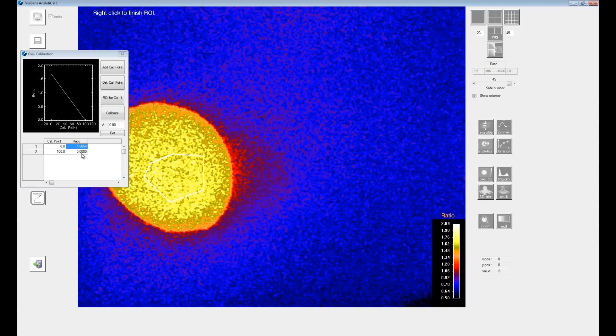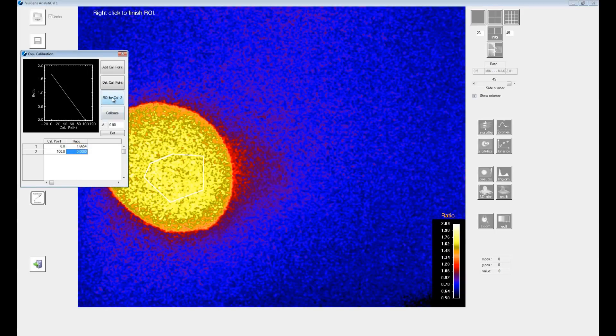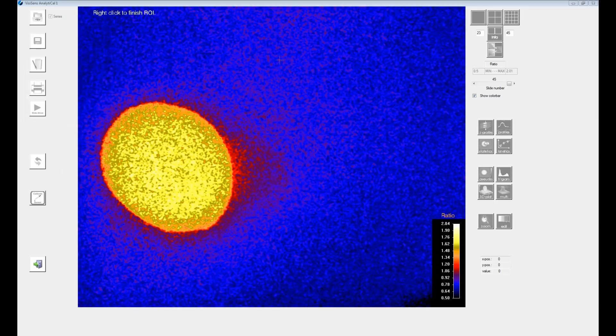Then select the ratio value for calibration point 100. Click on the ROI button and select the respective region where the sensor had been in contact with ambient air.